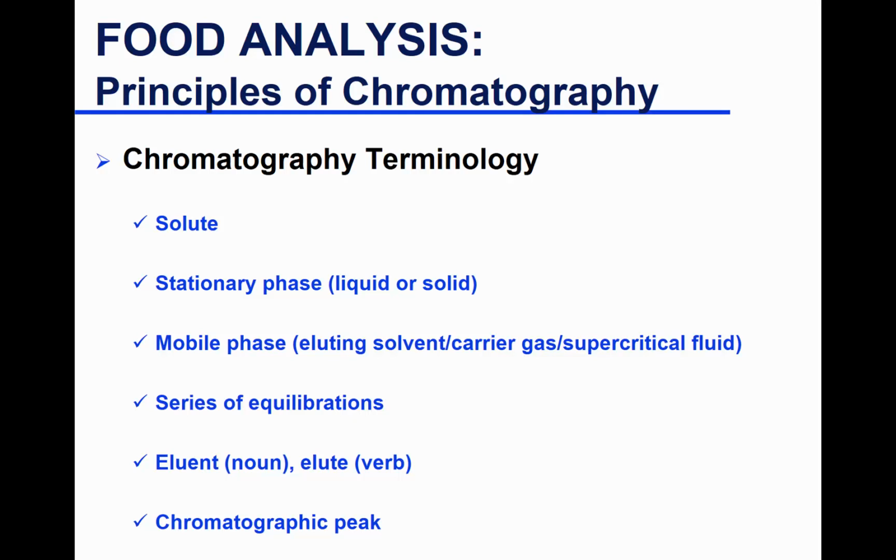But here you will have either absorbance or conductivity, depending on what detector you have attached at the end of the system. So when your compound is leaving, it's getting detected by a detector. The detector could be a UV-vis detector for HPLC or a conductivity detector for GC, but obviously we have all sorts of different detectors, which we'll talk about for each HPLC and GC.